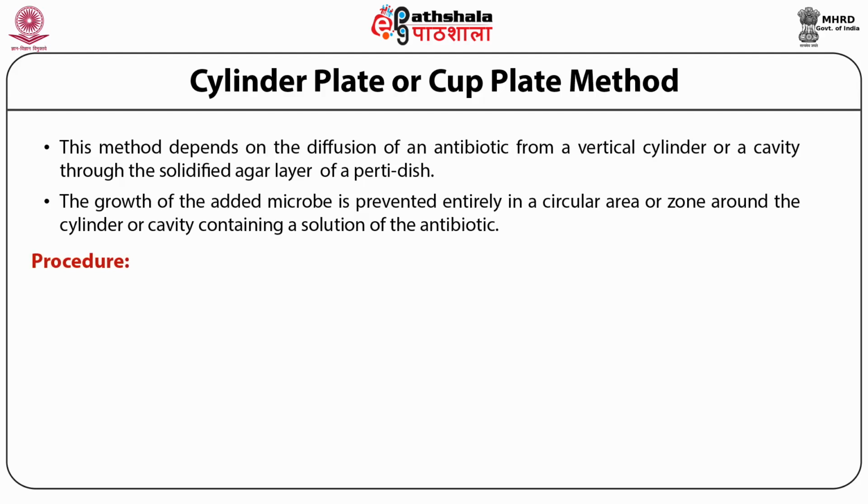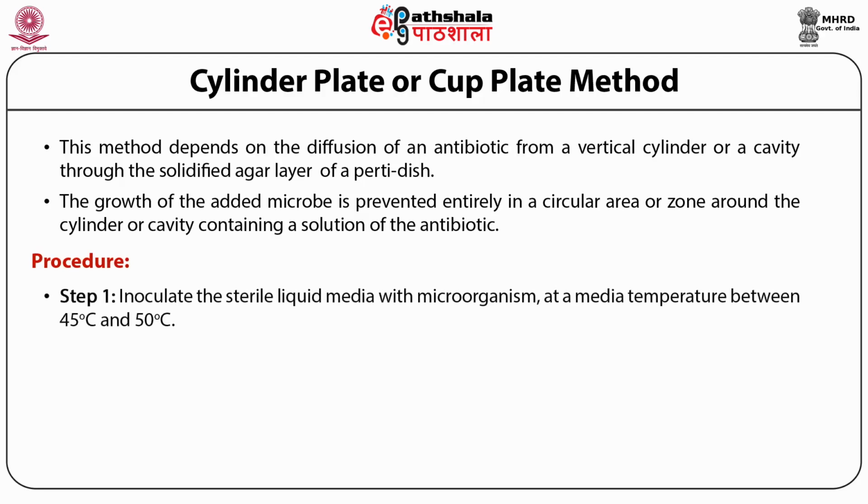Procedures, or experimental procedures, to carry out cylinder plate antibiotic assay. Step 1.